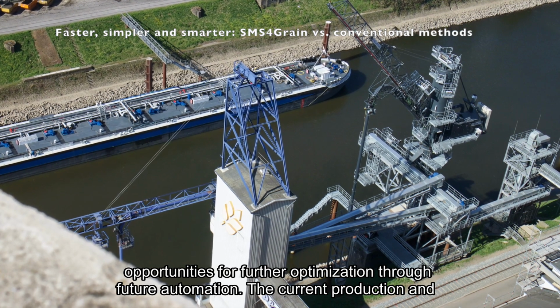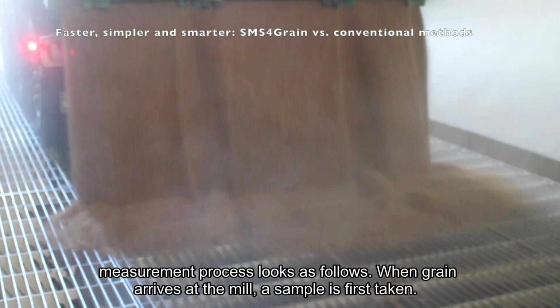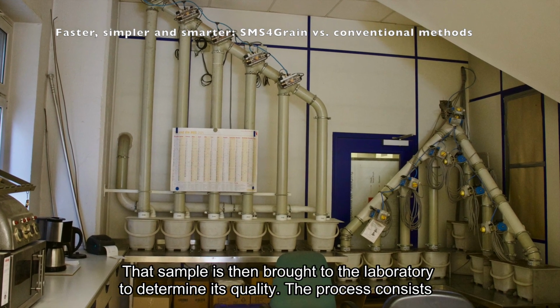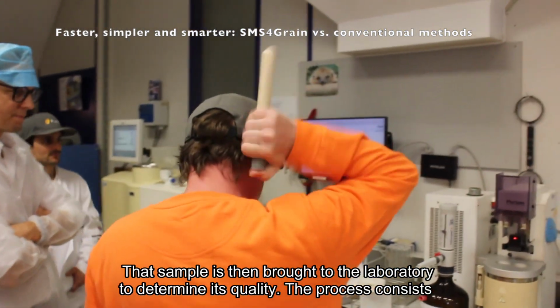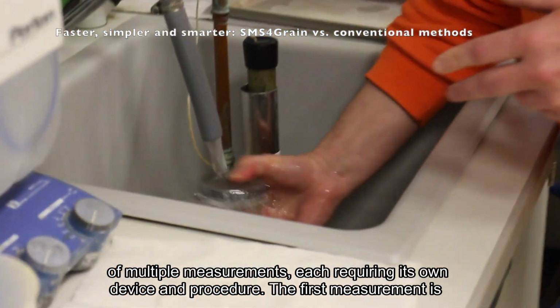The current production and measurement process looks as follows. When grain arrives at the mill, a sample is first taken. That sample is then brought to the laboratory to determine its quality. The process consists of multiple measurements, each requiring its own device and procedure.